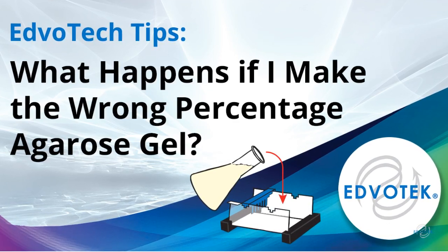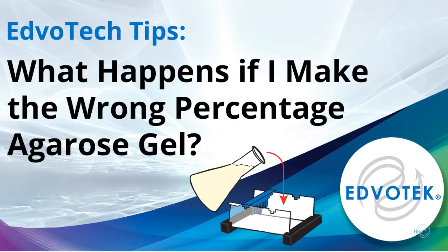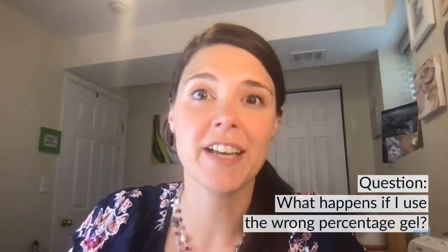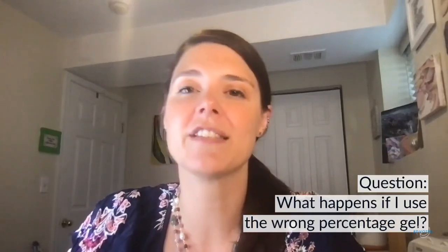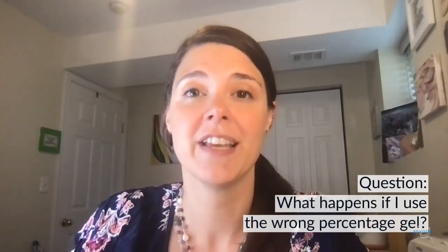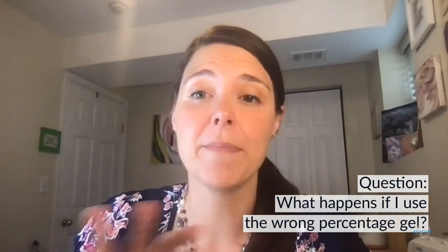Edvotech tips. What happens if I make the wrong percentage agarose gel? Hi everyone, my name is Dr. Danielle Snowflack and I am a scientist at Edvotech. Today we're going to be discussing a common question that we receive about our DNA electrophoresis experiments: what happens if I make and use the wrong percentage agarose gel?